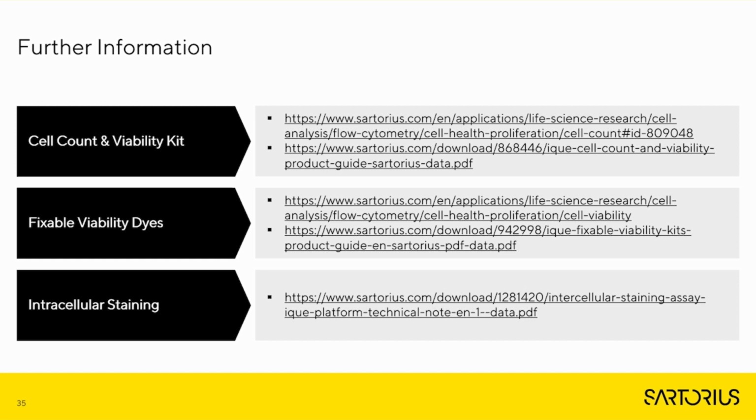So we have some sections on cell count and viability, the fixable viability dyes, and also a technical note on intracellular staining to give you an idea of a bit more detail of how we performed the intracellular staining that we just showed on the webinar in those case studies.